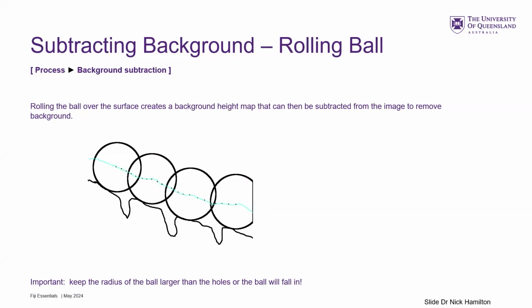So the key thing is, so maybe I'll flip it. Who's done a background subtraction in FIJI? 1 or 2 people. Who just left it at 50 or went maybe 100? You just guessed. You didn't actually scientifically determine what number that should be. That's what most people in my experience do. They just go, oh, 50 looks good, that'll do. Or 10 or 5, whatever.